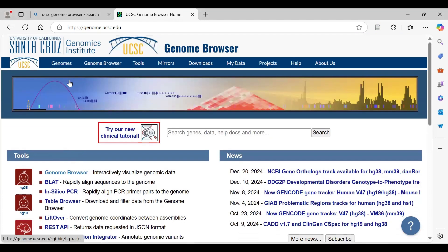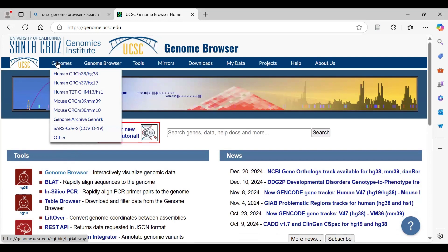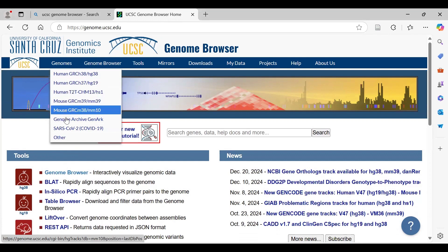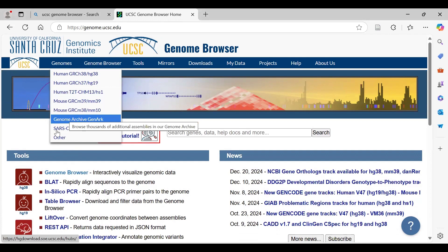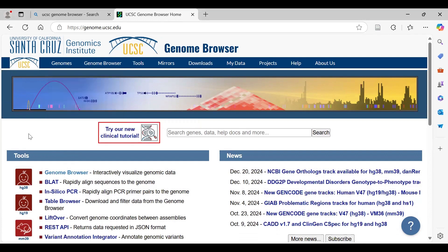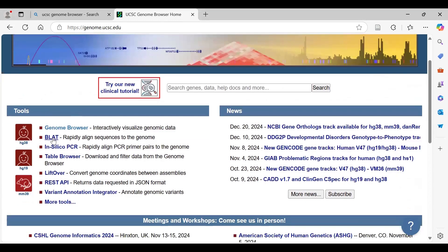On the homepage, we have a Genomes section which includes assemblies of different organisms. The first three are human, then we have mouse, then Archive GenArc, then SARS-CoV and other organisms. According to our research question, we can select the genome assembly and then search our query.